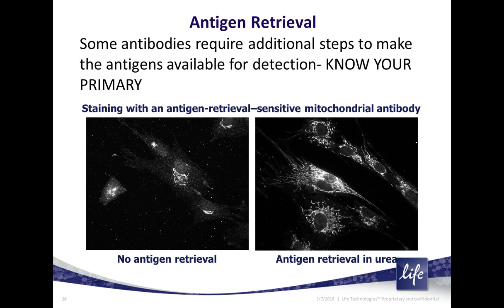Temperature for storing antibodies: 4 degrees is often fine for short term, but for longer term storage, you'll want to aliquot and store at -20. Some distributors suggest making it up in a 50% glycerol solution to help prevent it from freezing solid, because repeated freeze-thaw can sometimes degrade your secondaries.